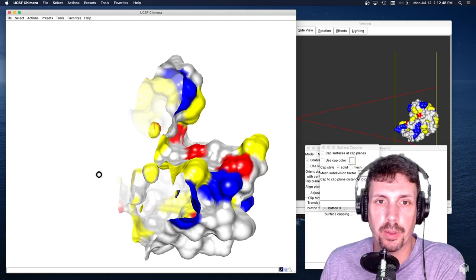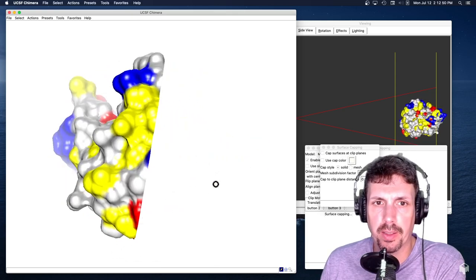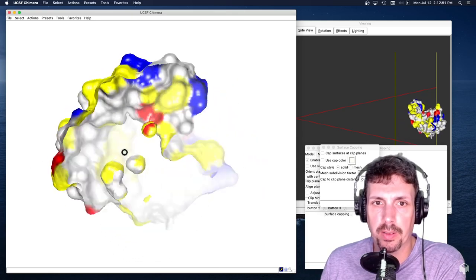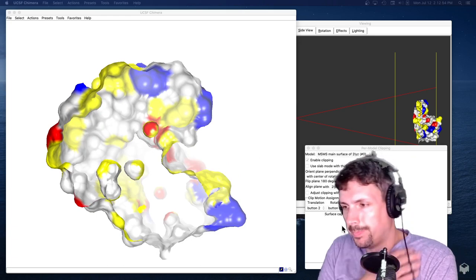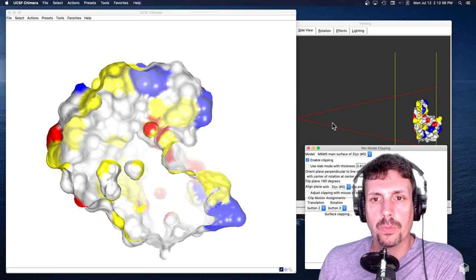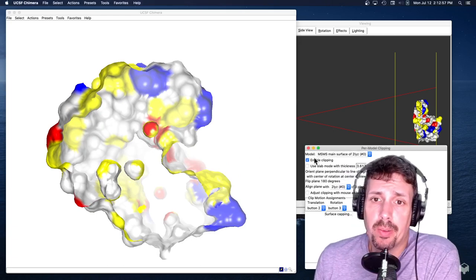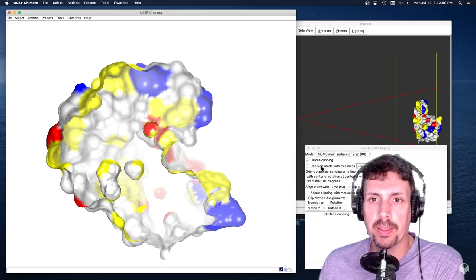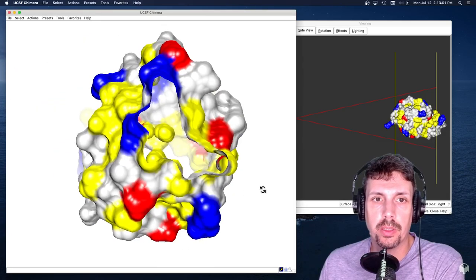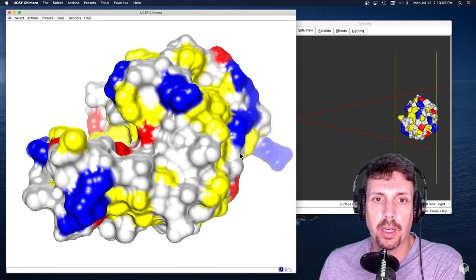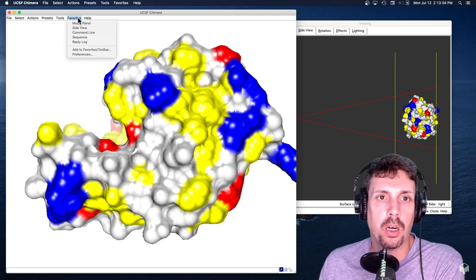So. But if you don't clip, it's like, so you kind of see inside. Almost looks like it's an empty shell. You might have a better way. You might not. But that is how you can cut open your model.